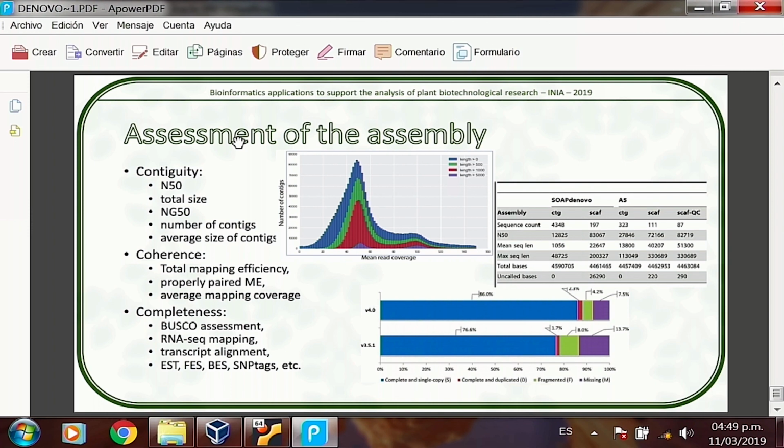Yep, that's not good. Because usually, if the expected size of a gene is longer than the average size of your contig, that means that most of your genes are going to be split across different contigs. If you get that, then you will not be able to mine genes or to find complete genes in your assembly. And that's one of the main reasons why we do a genome assembly, to find genes. If a single contig doesn't contain at least one single gene, then your assembly is not going to be very useful.